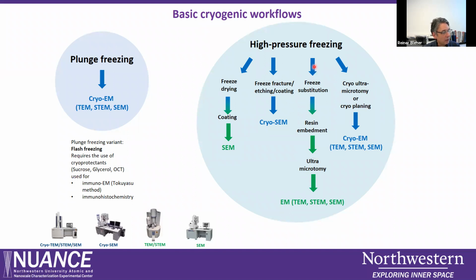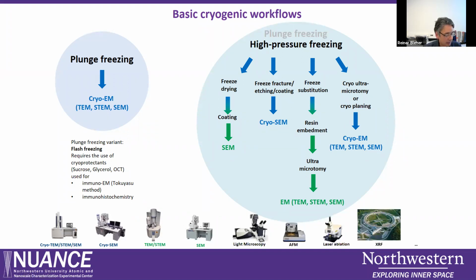So this route here, and this is the route I want to explain a bit more in detail now for the rest of the talk. And again, it's also always important to keep in mind that those samples are not just for electron microscopy, but for many other applications too.